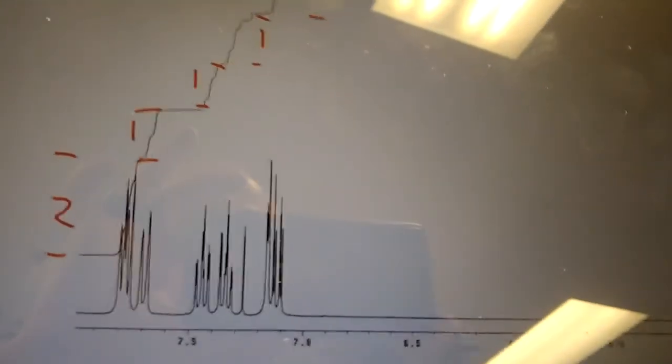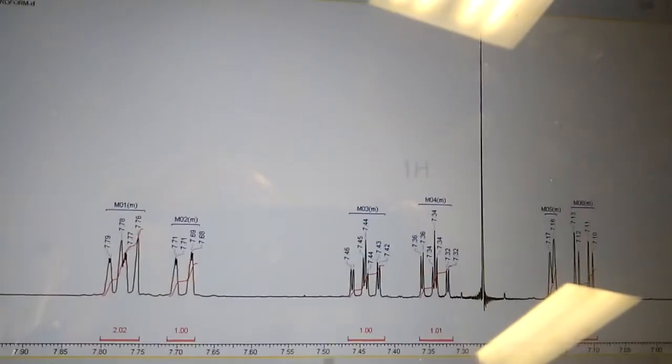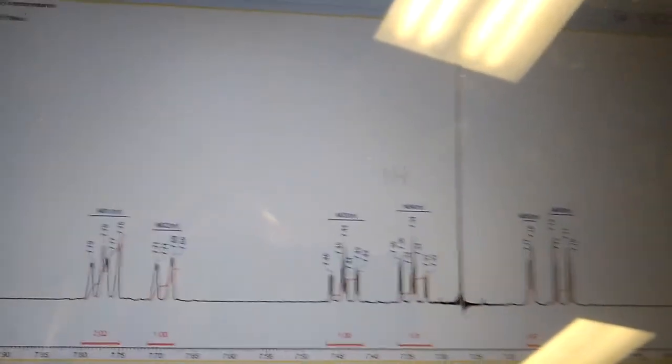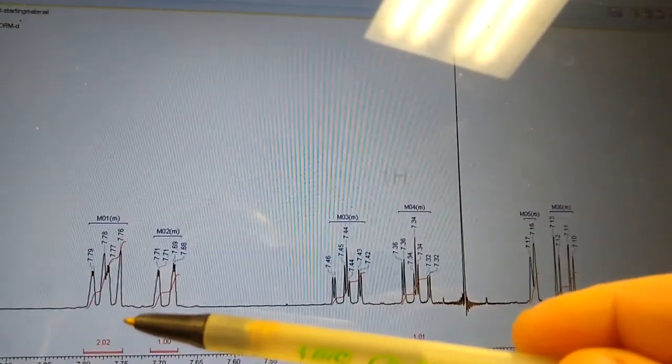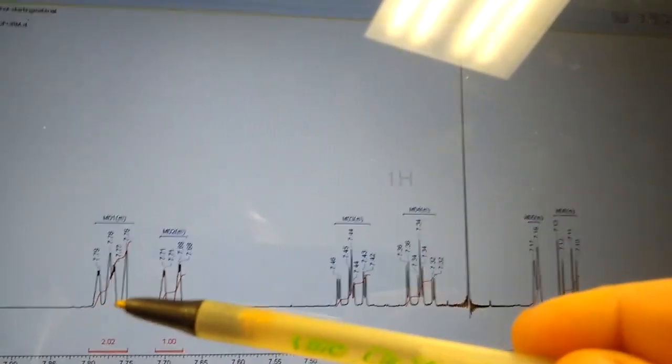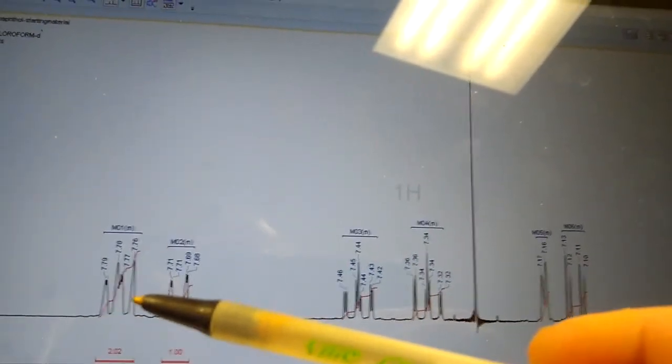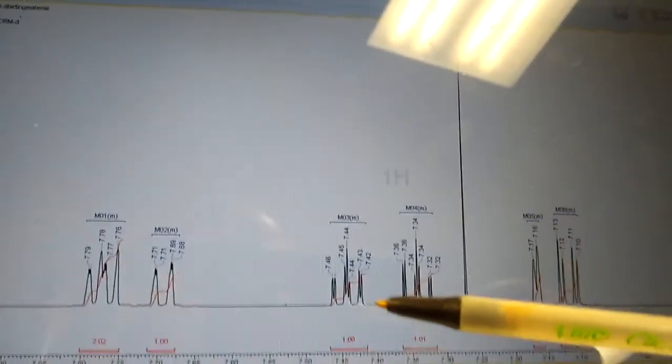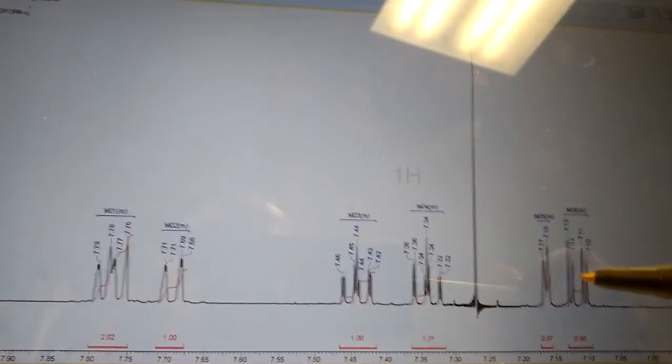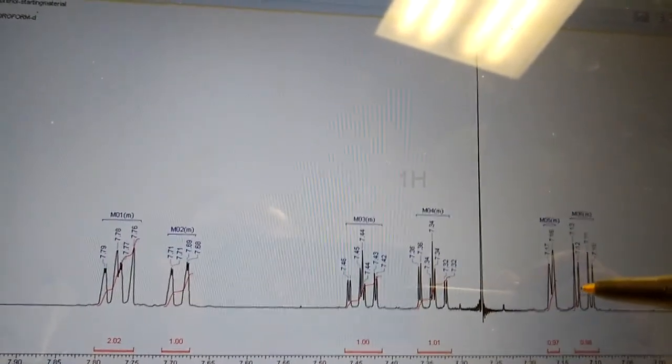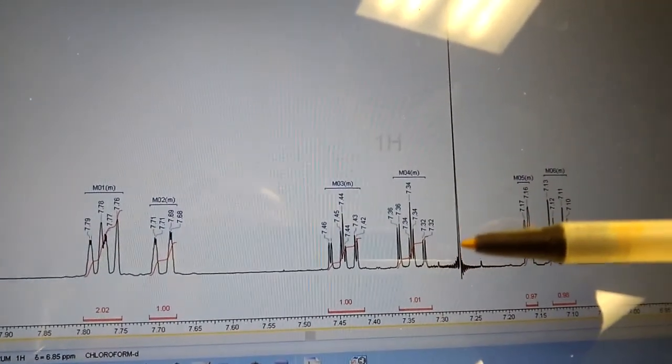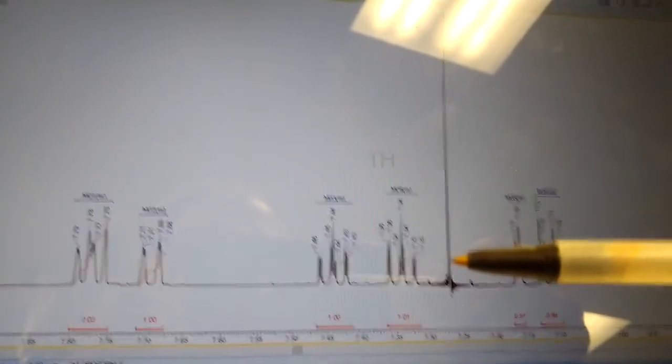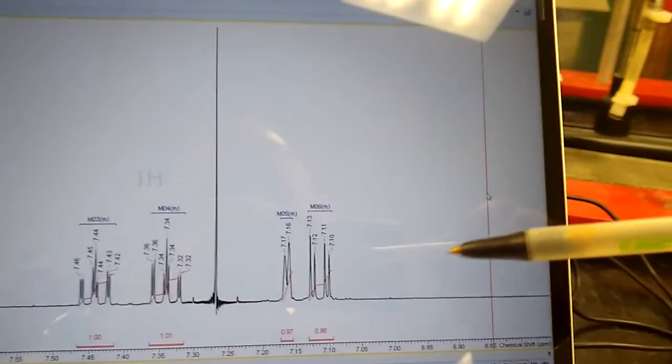You may also see a spectrum given to you like this where instead of having to measure with your ruler, the integration may be down at the bottom for you. So here this signal amounts to two, three, four, five, six, seven aromatics. And if you see one here at seven point two seven, that's always just the solvent that the sample is run in, so you would ignore that.